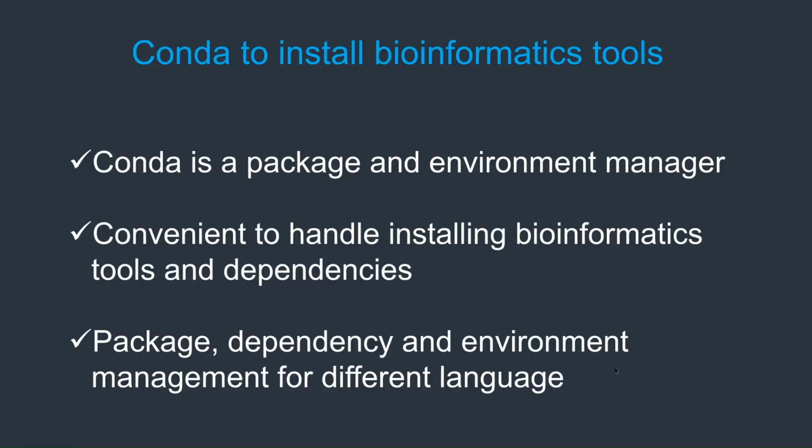In this lecture, we have discussed how to install a bioinformatics software. Also, we have discussed the different challenges to install bioinformatics software. In this lecture, we have also shown how to install Conda to manage packages and the environment. We have shown an example of installing Trimomatic using Conda. In my next lecture, I will show how to manage different environments for different projects within Conda.